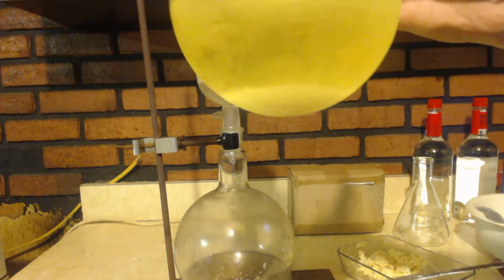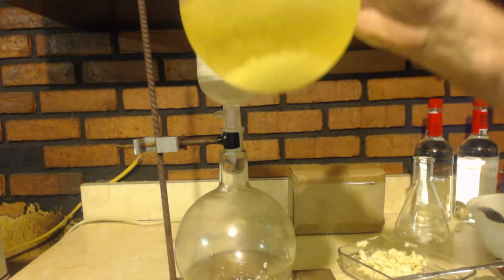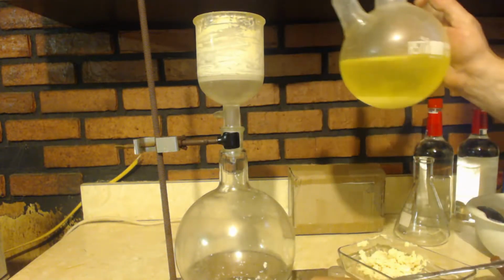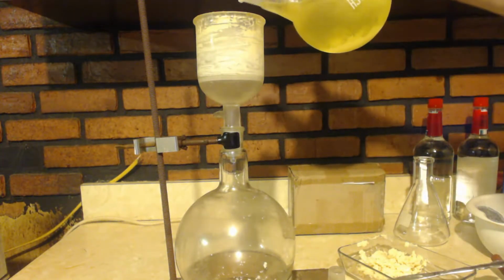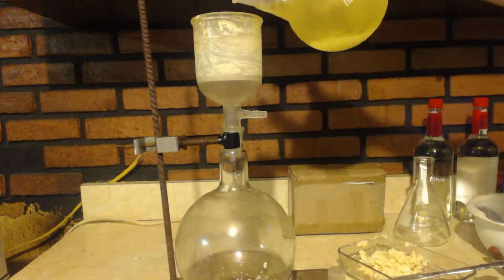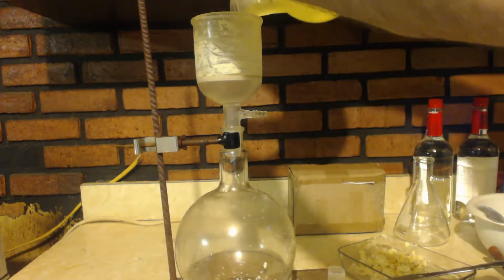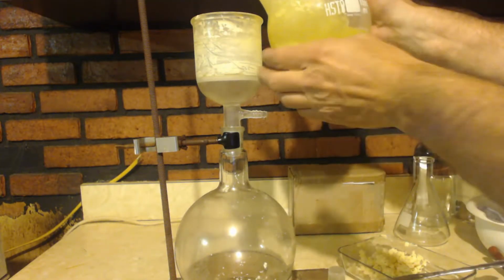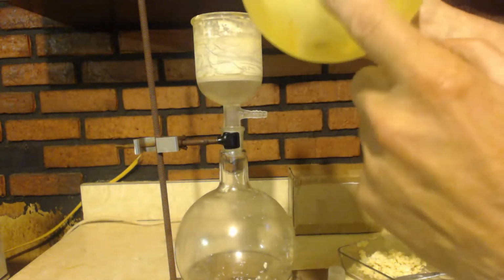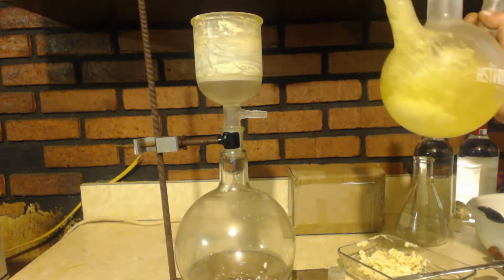Now this is all water pretty much, so I actually had to do it twice because I did it too long and it froze. Anyways, this stuff has been sitting here forever. I don't even know if it's going to make it through this. This hasn't been washed in I don't know how long. Oh, looks like I did it again. I let it freeze up. See there? But this is precip down here. I'm going to have to let it unfreeze.